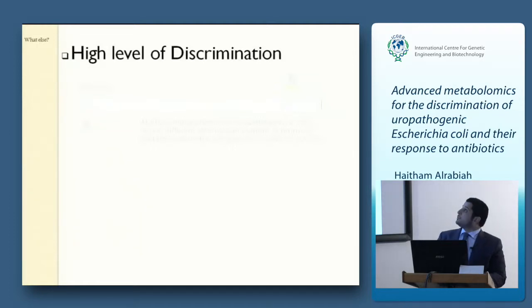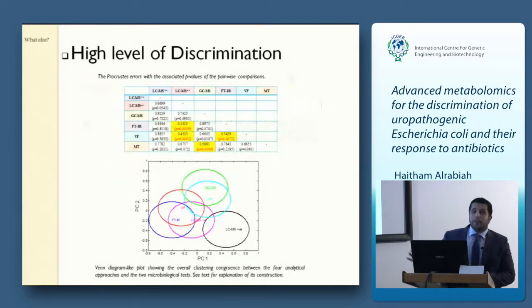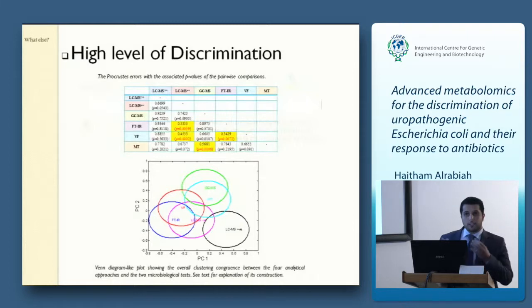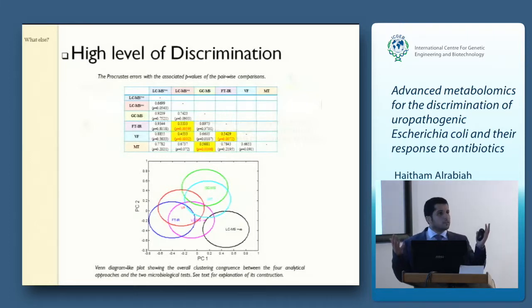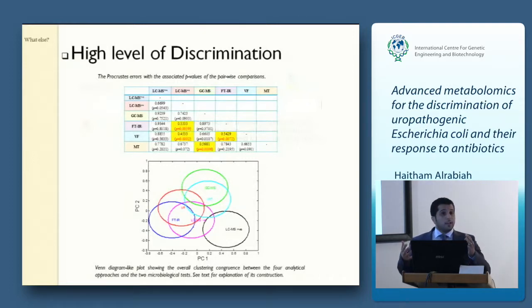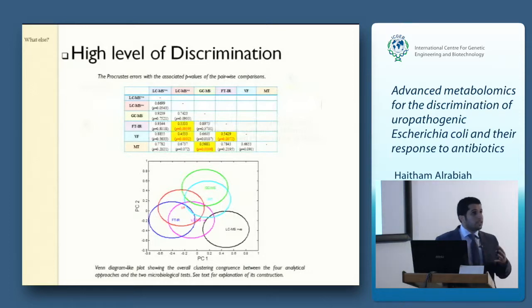Cluster analysis was applied on the results, trying to see if there is any similarity between the platforms or analytical techniques, and if there is any correlation between analytical techniques and the ordinary techniques. We used cluster analysis and generated six scores plots. Then we used Procrustes transformation, trying to match these PCs together and see if there is any correlation in terms of spatial arrangement.